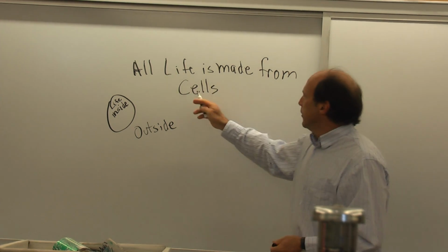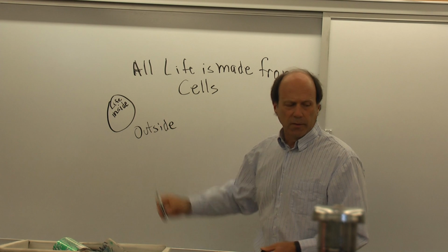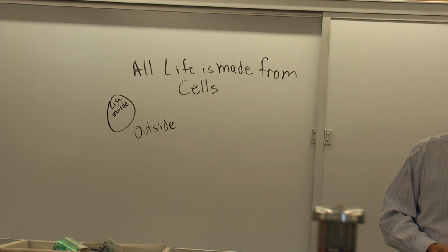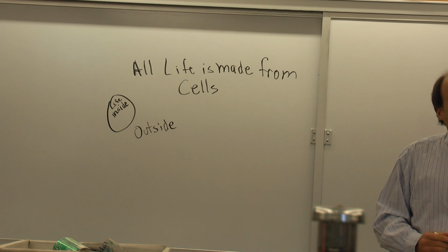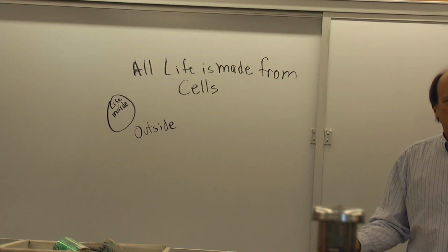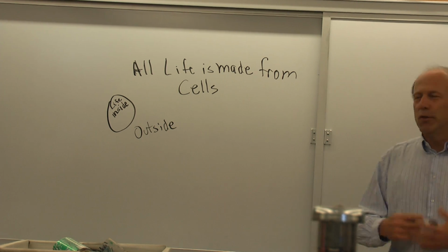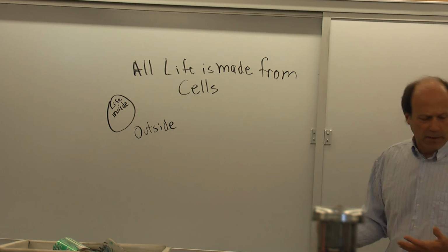So that's why the idea of a cell is so fundamental, and why isolating cells is kind of an interesting thing. If you want to study life on any level, animals, humans, plants, anything, you have to know something about cells, and we're going to be isolating cells today.